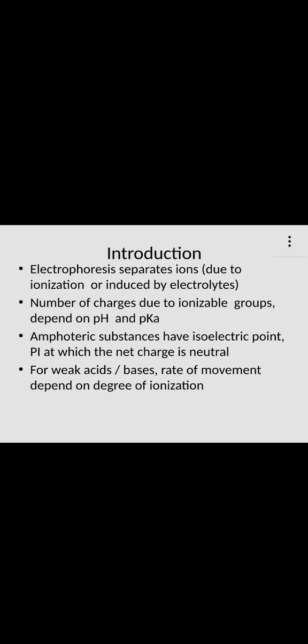So you may have some neutral molecules being attached to a charged group and thus facilitating separation. For example, borate associates with the neutral sugars and can therefore be used to carry out electrophoresis on sugars which are neutral.